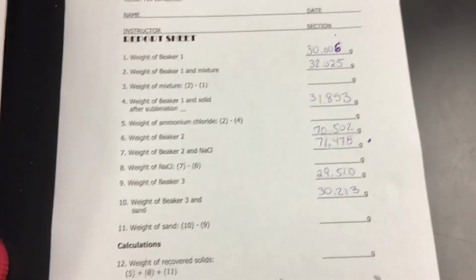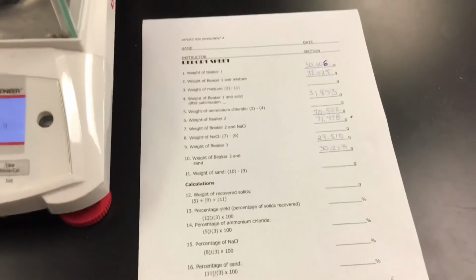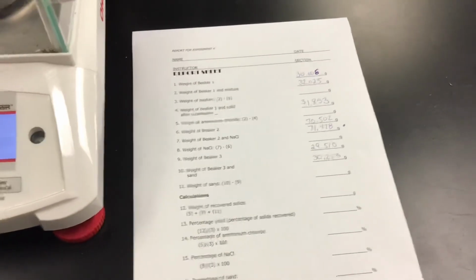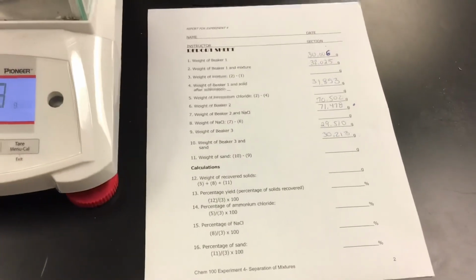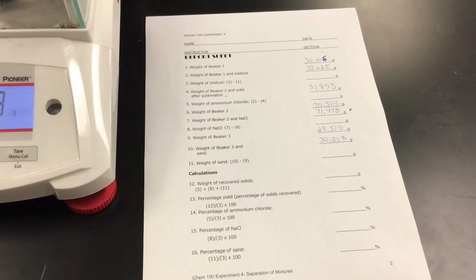All right, so you have all the data that you need to do this experiment, and all the methods that we did to separate those 3 compounds of the mixture were all physical means, right? They're not chemical. We didn't break anything apart. We just separated the 3 components. All right, that's experiment 4.